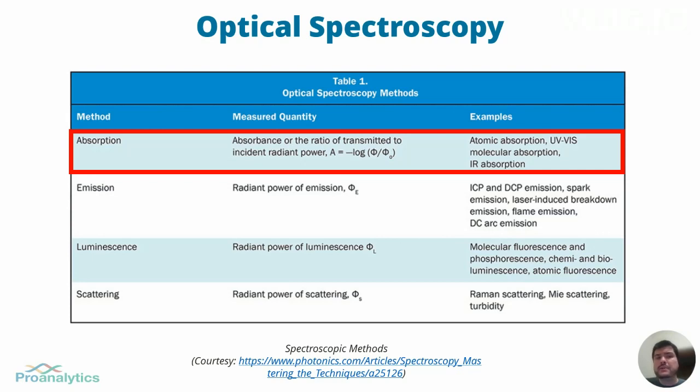Another common method of absorption spectroscopy is UV-Vis spectroscopy. UV-Vis spectroscopy utilizes the ultraviolet and visible ranges of the light spectrum, which typically consists of 200 nanometers to 800 nanometers range of the spectrum. The molecule of concern changes electronic energy states due to the absorption of light within the UV-Vis range of the spectrum. For the absorption to happen, the energy of the incident light must match the energy of a possible transition between electronic states of the molecule.